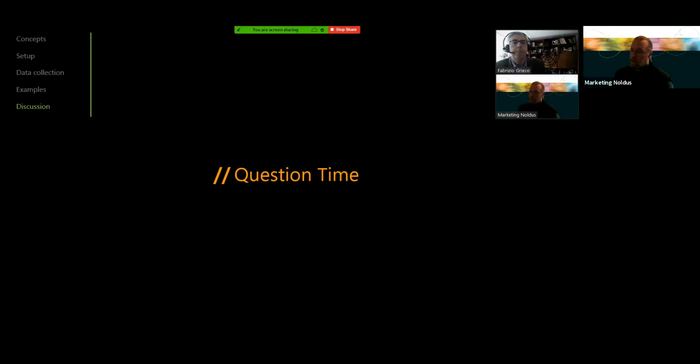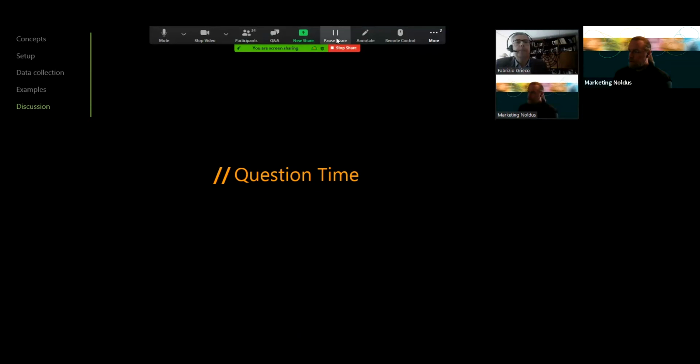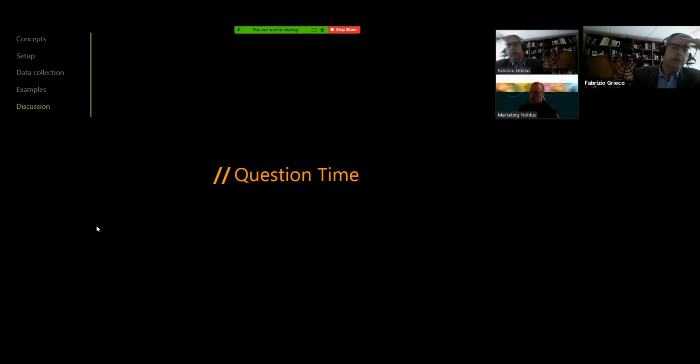Great. So there was a question for you back when you were talking about the velocity bins. Roberto was asking, you had mentioned doing some filtering to smooth those results. He's asking, could you explain which type of filter should be used? Well, you could check in the code.